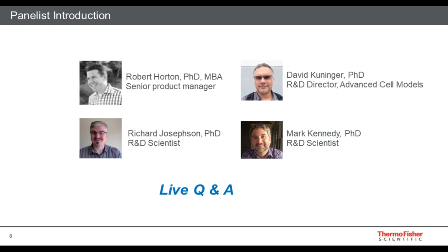So it was a big adjustment initially. One of the things that I mentioned during the preview, for some of the models that I first started working with, temperature-sensitive basement membrane extracts was a new level of difficulty that wasn't in any of the traditional 2D workflows that I had.